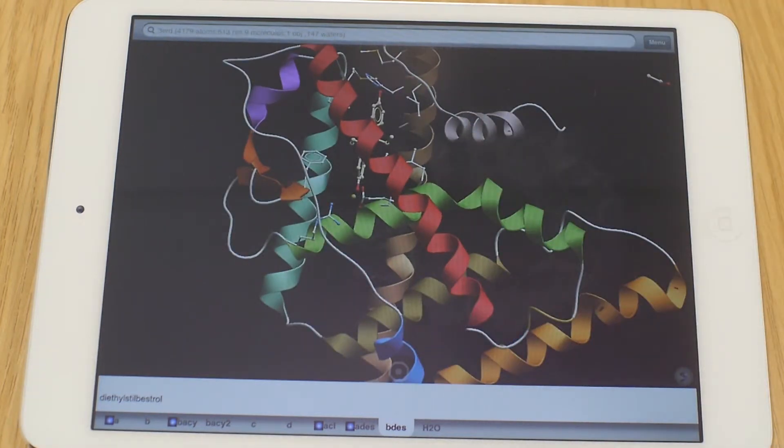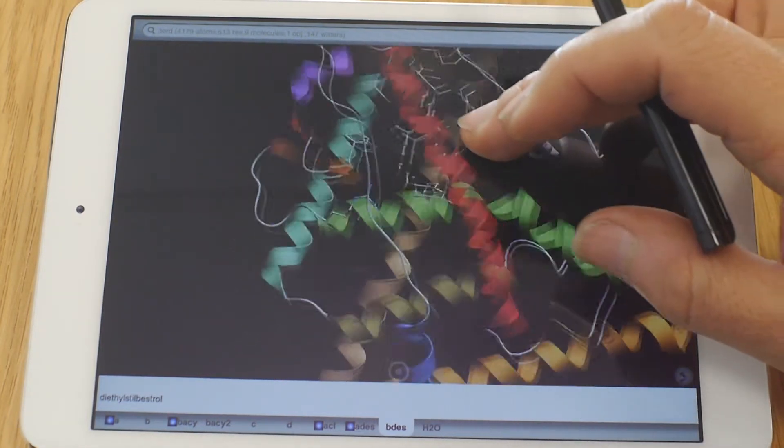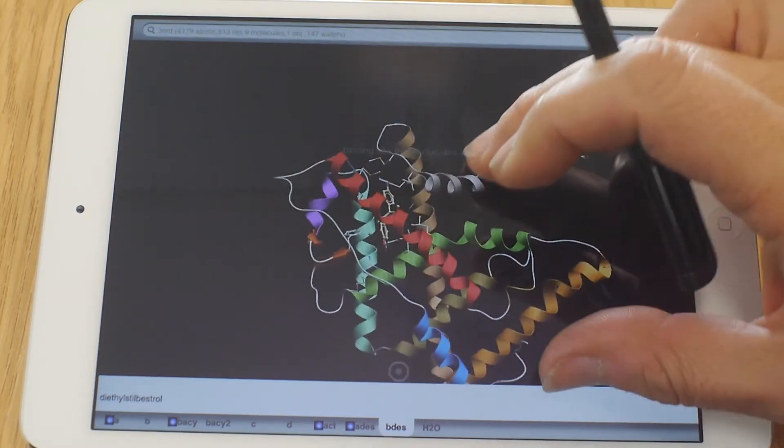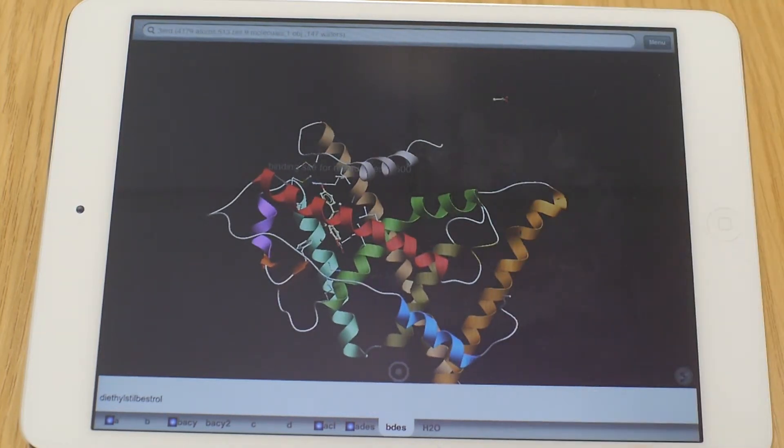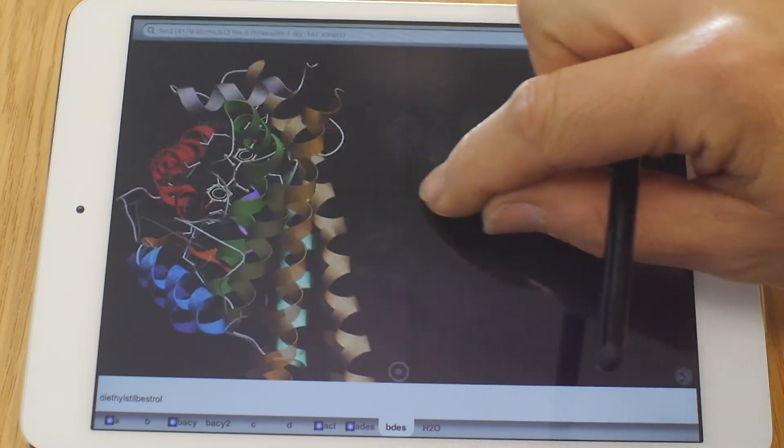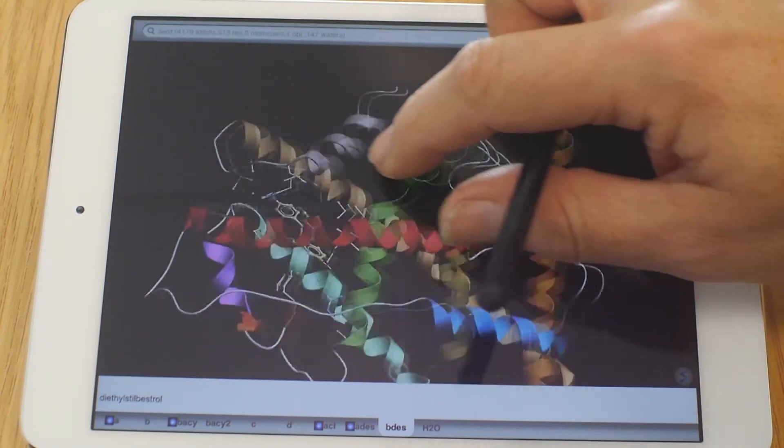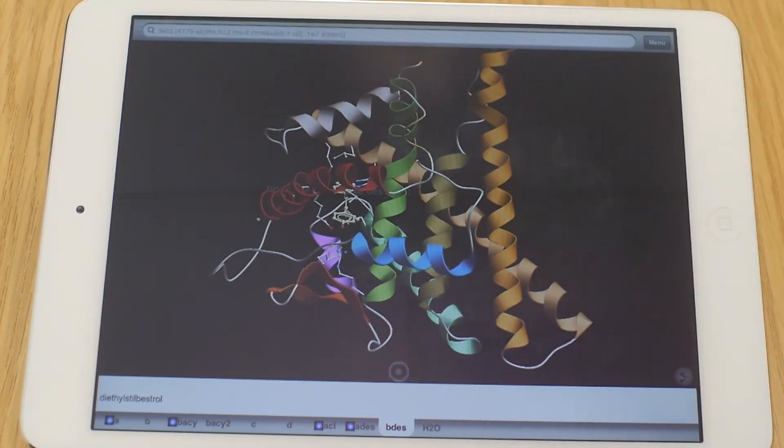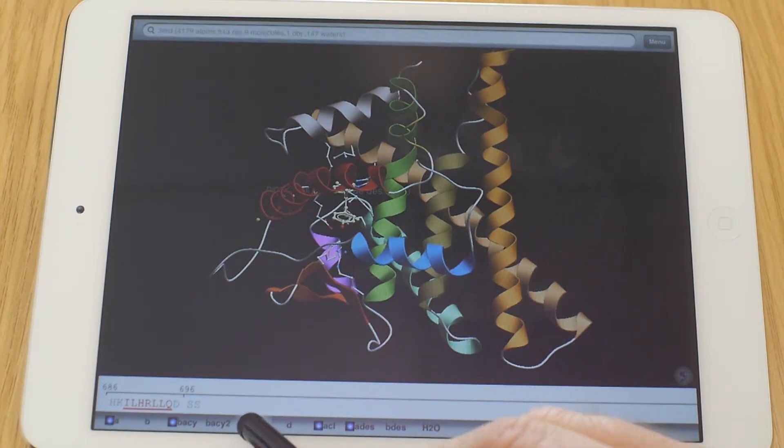Now if you click at the right buttons here in the bottom, you can visualize parts of what actually was acquired when they got the crystal information. So you can basically define the view that you want to have. And it shows you the sequence always, so you know what is what.